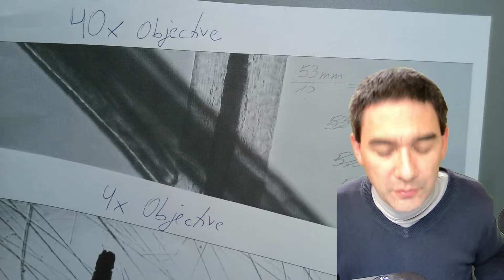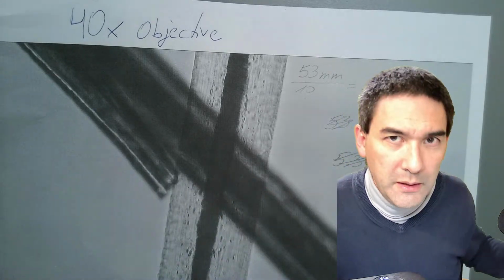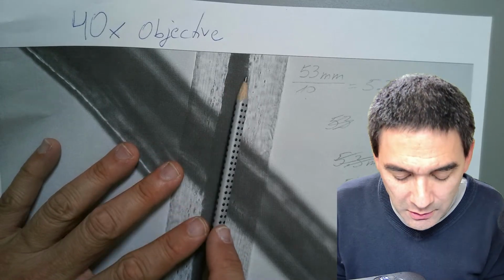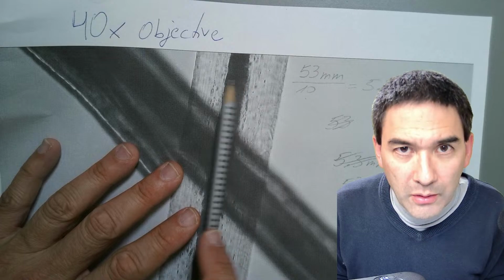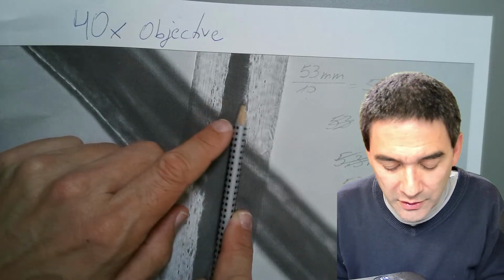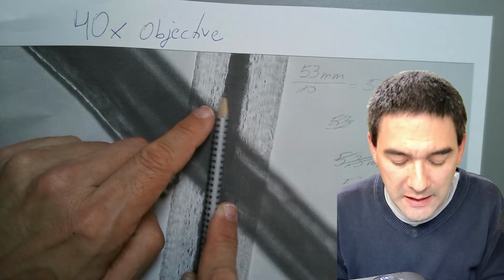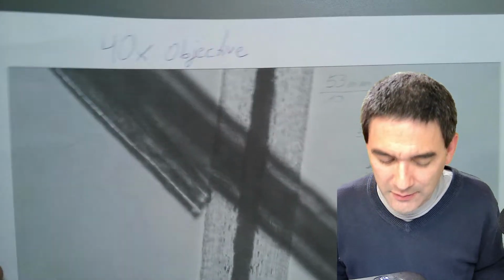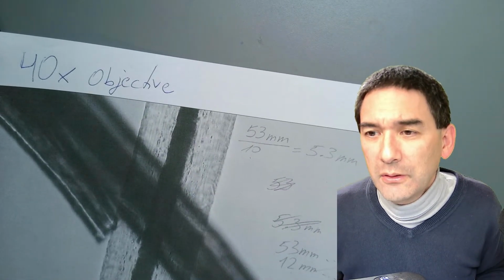It's an interesting thing that I found out: you can in many cases determine whether the hair you're looking at is human or not, because generally the size of the medulla in human beings is smaller than in other animals. If it's around a quarter to a third maximum, then it's probably human hair, and many animals apparently have a medulla that is significantly larger. I just read that somewhere. That's also quite interesting. So let me have a look here.